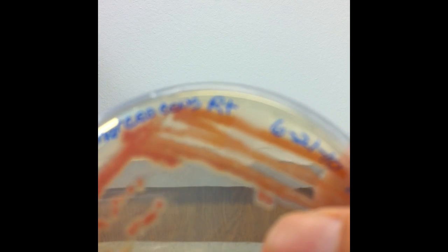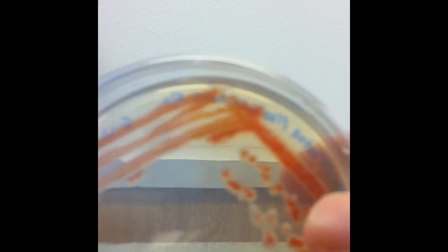What I have in front of you here is Serratia marcescens. The interesting thing about this plate of Serratia is it has bright red colonies. This one was grown at room temperature. You can notice the RT stamp on there for its entire life. And that room temperature growth, especially the start of growth, tends to give Serratia red colonies.